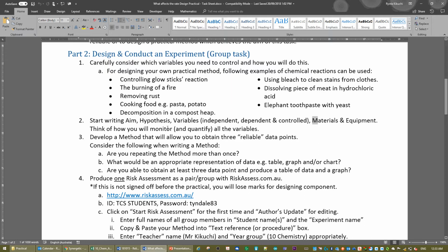You will also need the quantity of the materials, such as say 20 mils of hydrogen peroxide type of thing. But how many times you would need, you have to multiply by how much you are using.